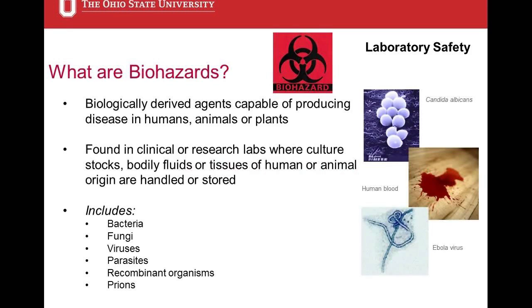We don't worry about them as much from a human standpoint because they don't affect us, but if they get out in the environment, bad news. You could kill all the trees depending on what type of biohazard they are. Obviously, the animal biohazards, they do affect us a little bit depending on what they are because we don't want to take them home. If it's something that could affect our pets, our cats or dogs, or hamsters, our gerbils, we don't want to carry those home with us because we certainly don't want to make our pets sick.